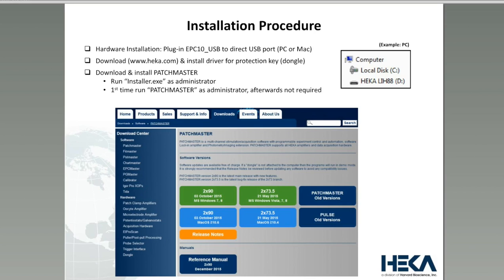You can usually download two different versions from our website.